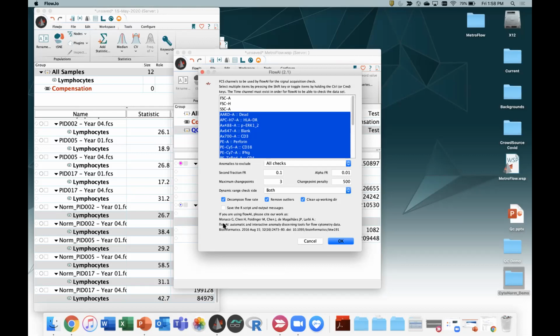It's a good request. I think, unfortunately, because it's a plugin as opposed to something that we have preferences for in FlowJo, that's going to be on us. So we should actually take care of that and do that. So sorry on that one. We'll get to that. No, it's okay. I was just curious to see if there's a way of doing that I was not aware of. So that's good to know.